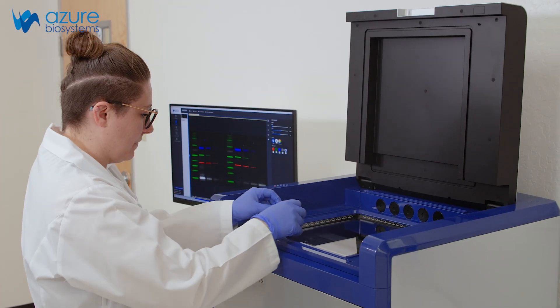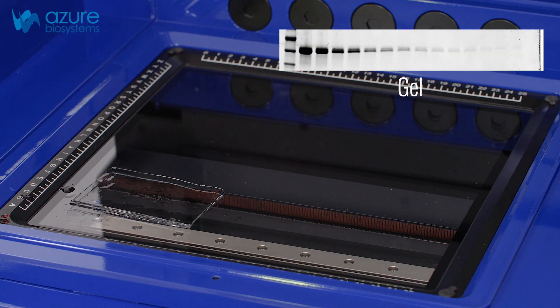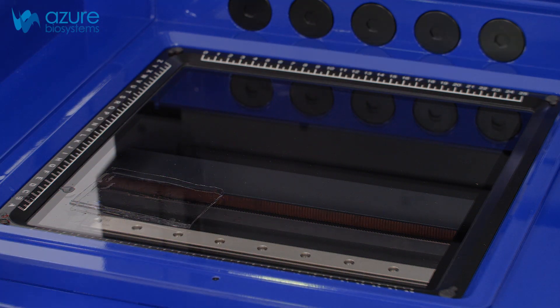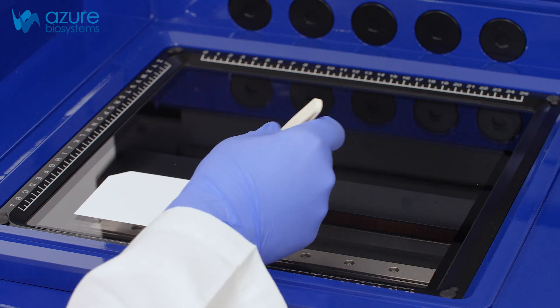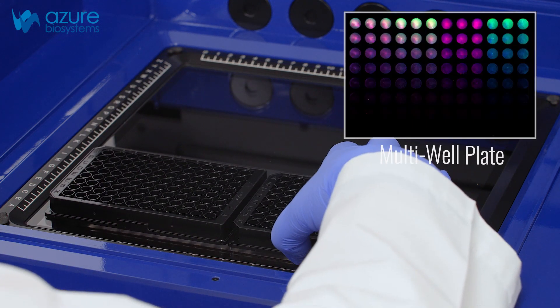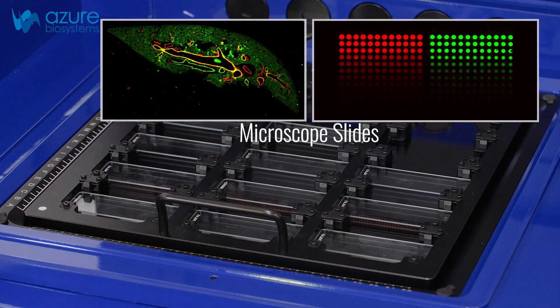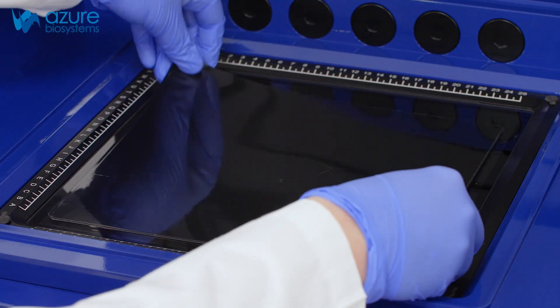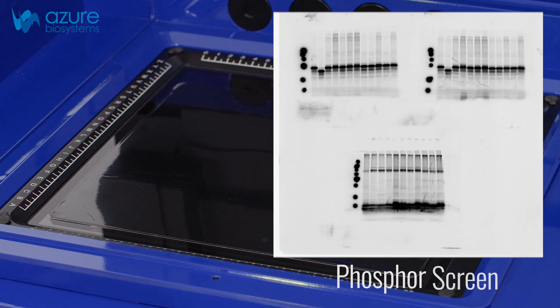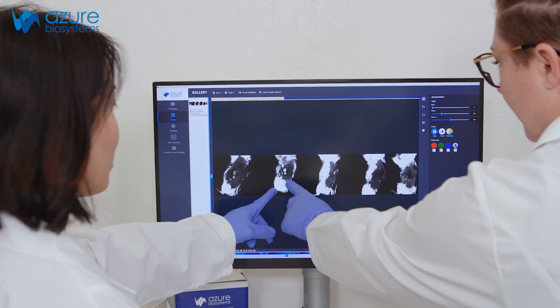Through its innovative design, the Sapphire FL supports imaging of in vitro to in vivo sample types including gels, blots, multi-well plates, slides, phosphor screens, and living small animals.